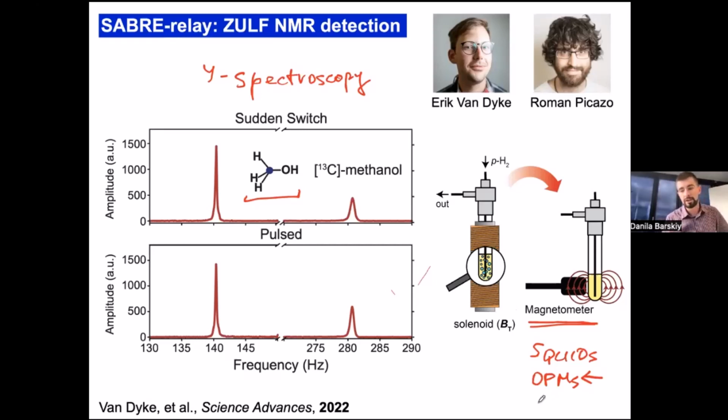And this is just an interesting tool to explore regimes like zero-field NMR. They're most sensitive, they're relatively easy to use, and they will sense your spin chemistry at the zero-field conditions.